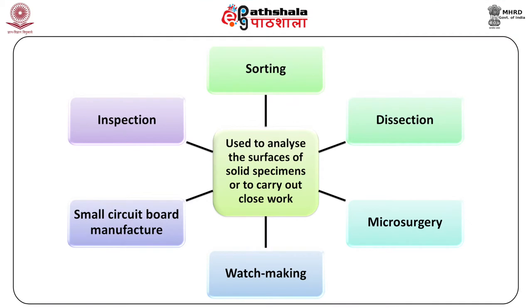The stereo microscope is frequently used to analyze the surfaces of solid specimens or to carry out close work such as sorting, dissection, microsurgery, watchmaking, small circuit board manufacture or inspection.